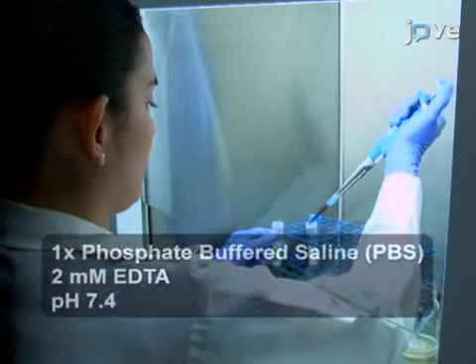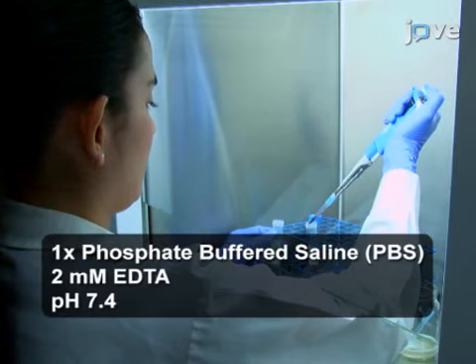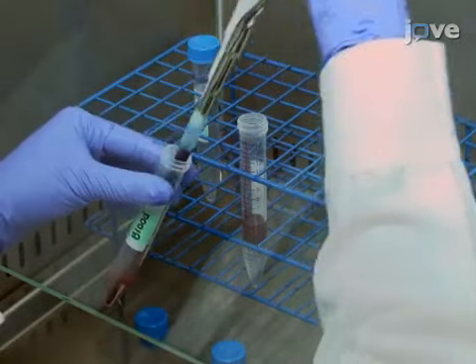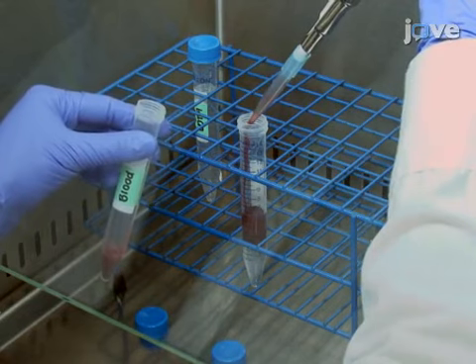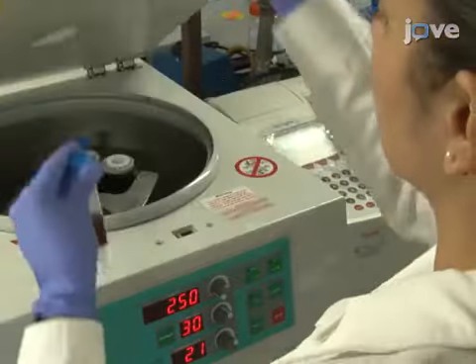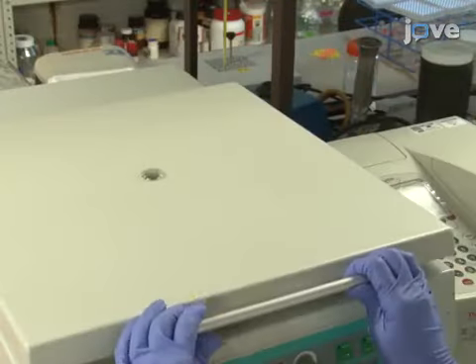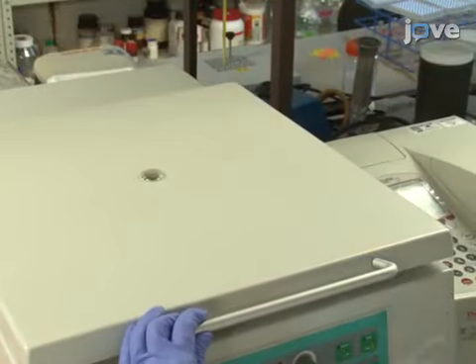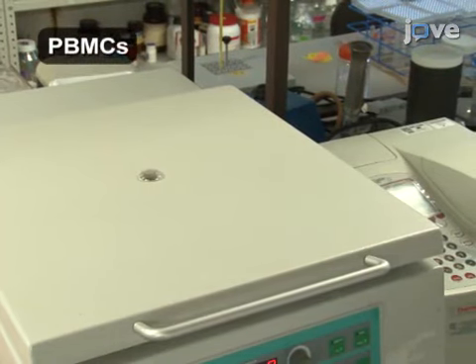Begin by diluting two milliliters of peripheral blood from healthy human donors with two milliliters of sterile PBS EDTA. Slowly dispense the diluted blood on top of three milliliters of 1.077 density sucrose solution. Then centrifuge for 30 minutes at 250 times G at 21 degrees Celsius with no break to generate the gradient of peripheral blood mononuclear cells.